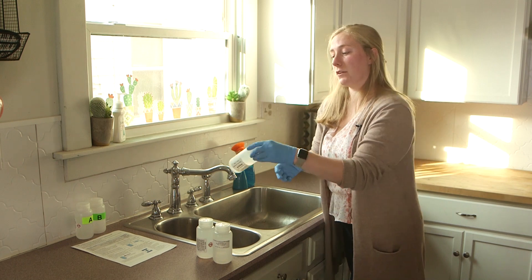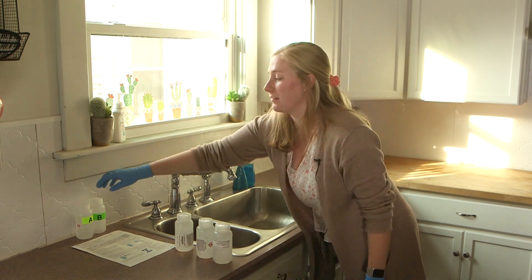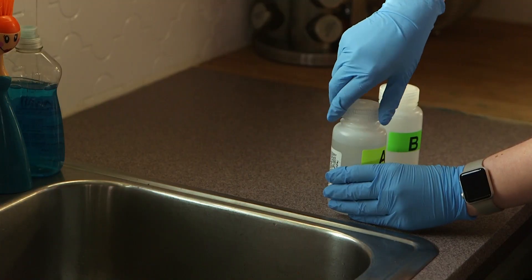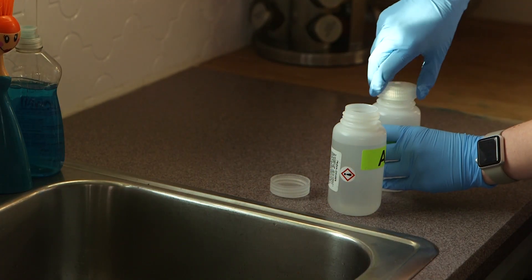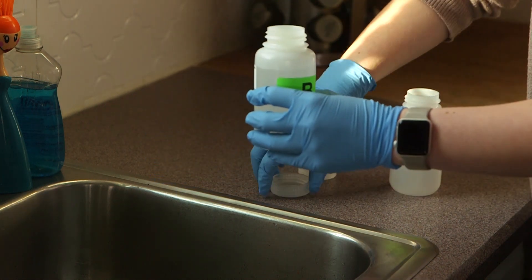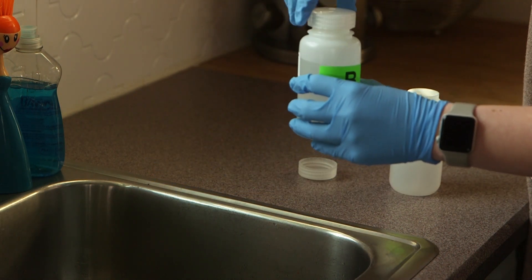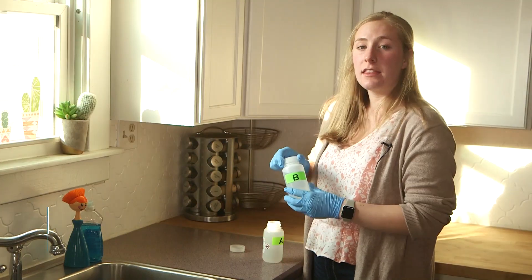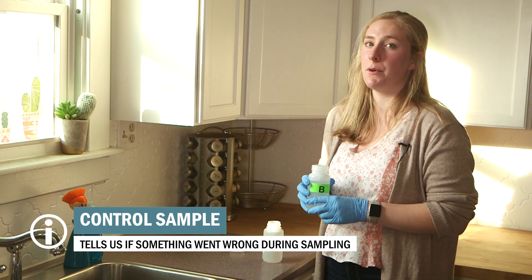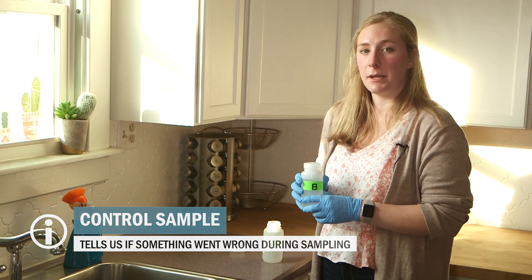Now that you've completed this for all three bottles, turn your attention to bottles A and B. You can remove the caps of both bottles. Remove both caps and carefully pour all the contents of bottle A into bottle B. Screw the cap onto bottle B tightly and toss bottle A in your recycling bin. This is called a control sample and it is an important part of sampling because it lets the lab know if the sample may have been contaminated during the sampling process.